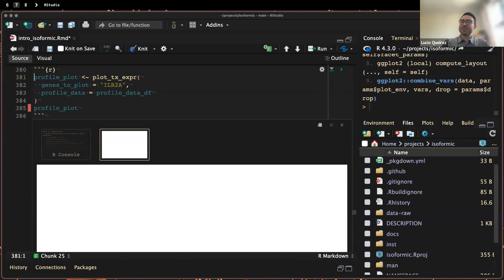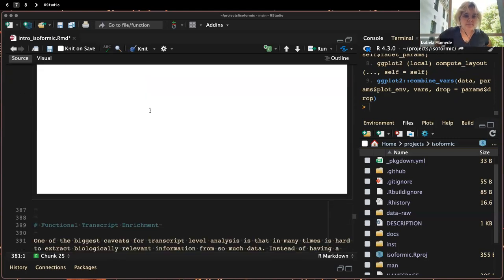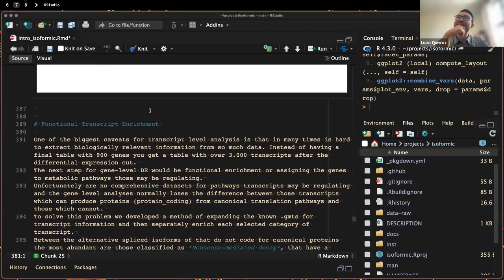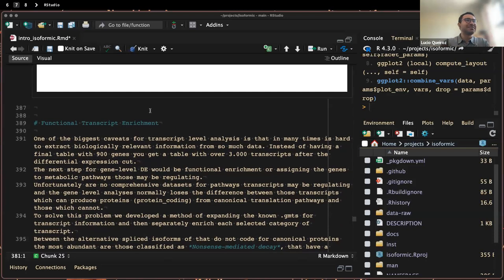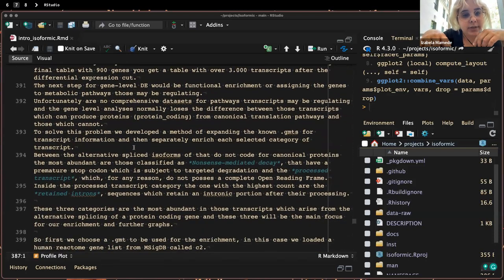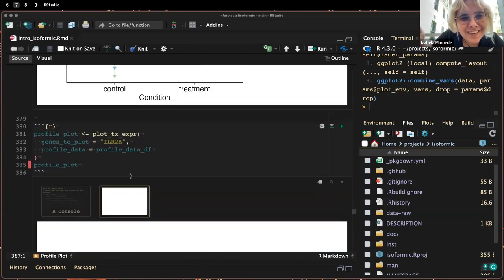It needs to be differentially expressed at least in one, right? So it means that it's not differentially expressed in any of the levels. But yeah, we actually need to keep the table without the differentially expressed genes to generate the graph, even if none of them are. Like Joy, one thing that we are doing, and it's already ready for the profile plot, is for you to plot the entire list and save it in a folder.